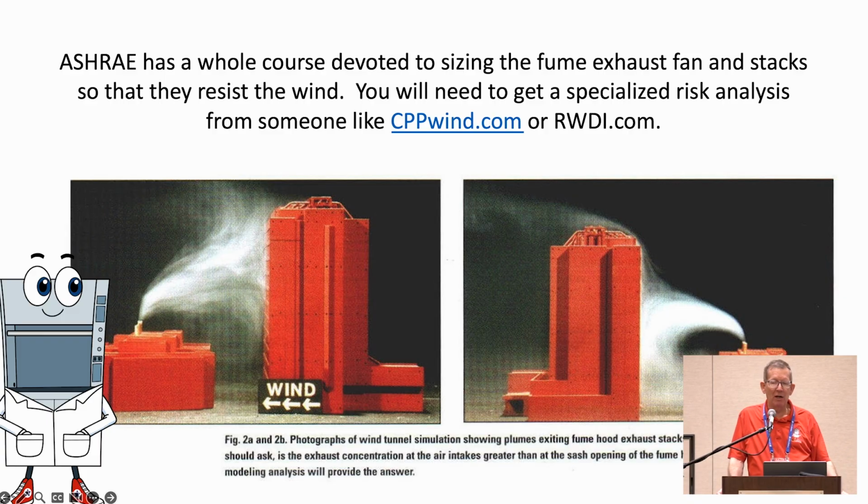There are so many parts to the design of the building. They have to concentrate on the chemicals and the wind. To pick the exhaust fan, they will tell you that if it's little, it's not going to work. So if you've got one hood, one fan, guaranteed failure.